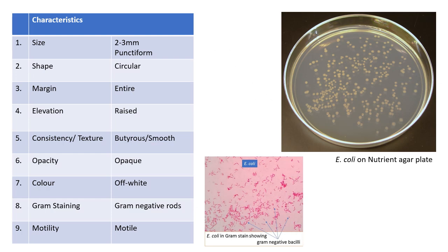The first example is E. coli on a nutrient agar plate. Always remember you need a well-isolated and fully grown colony to write colony characteristics. For E. coli, there are nine characteristics to report. Size is two to three millimeters — you can also report it as punctiform, meaning very small colonies. Shape is circular. Margin is entire, meaning a clean margin. Elevation — viewed from the side by holding the plate to eye level — is raised.